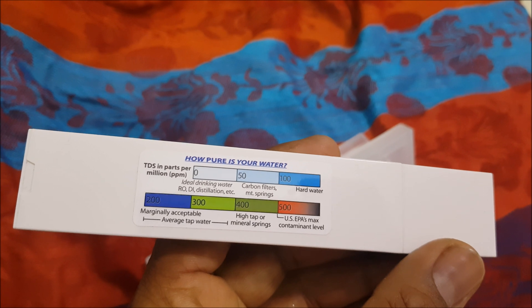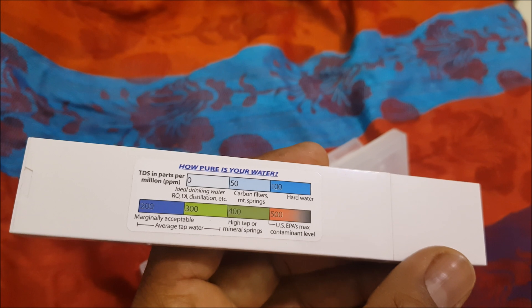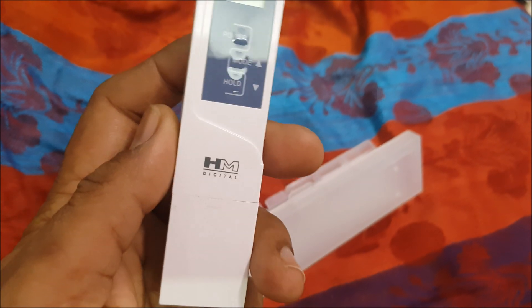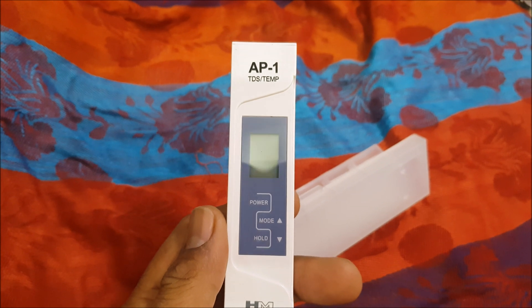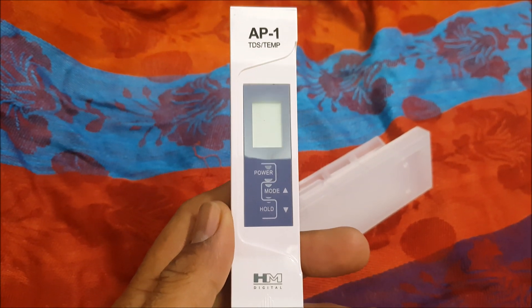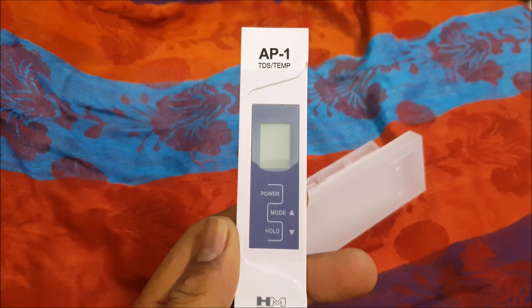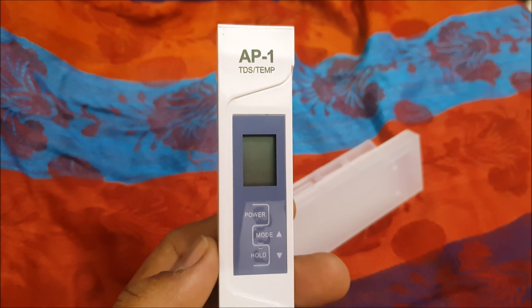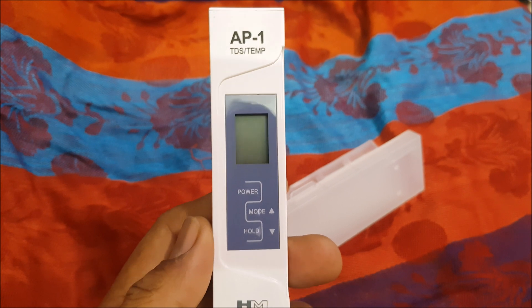The TDS readings are measured in parts per million — usually PPM. I purchased this to check water TDS. If your water source is a well or municipality supply, or if you are worried because it tastes very salty, this TDS meter comes in handy.